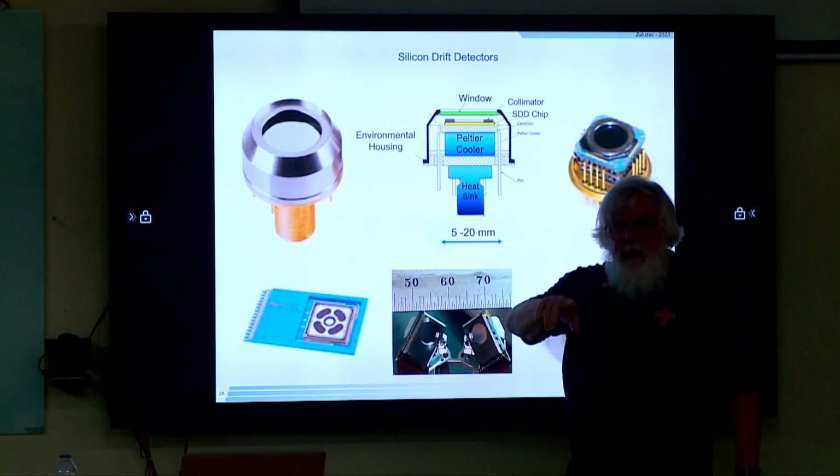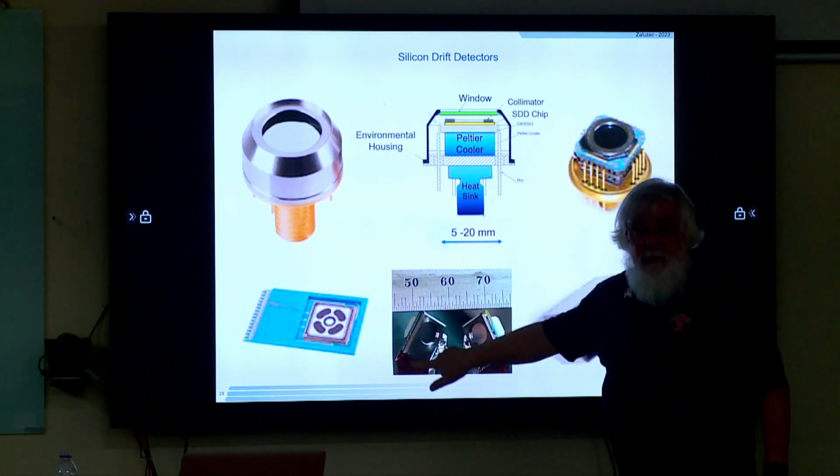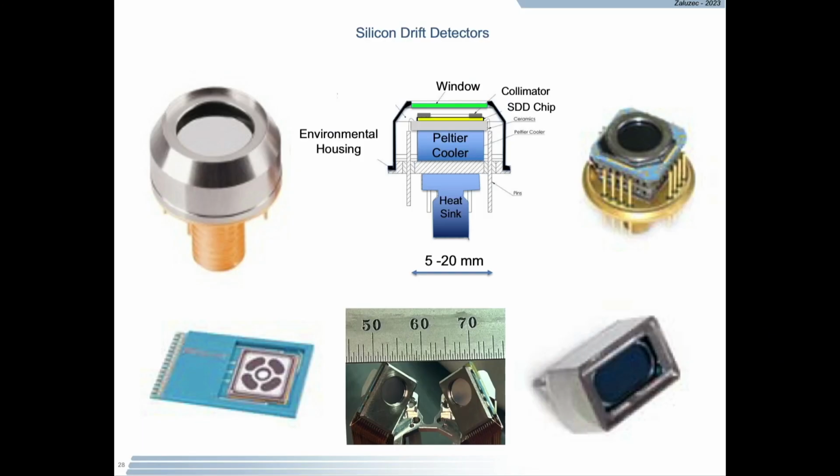You have a Super X system, right? That's a detector. This is what the detector for a Super X looks like. That's actually a detector from a Super X detector. I take things apart. I think Hamish will vouch for that.